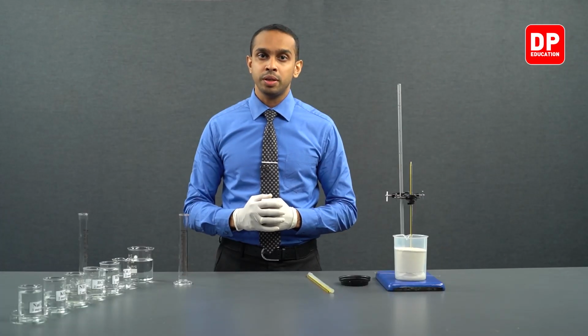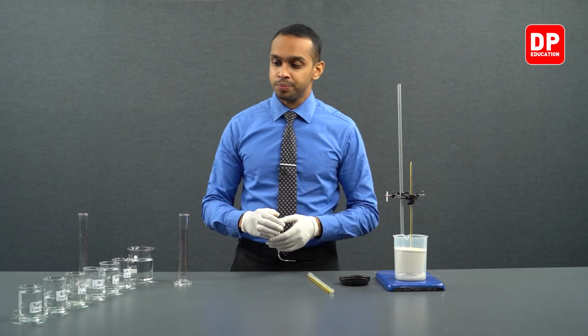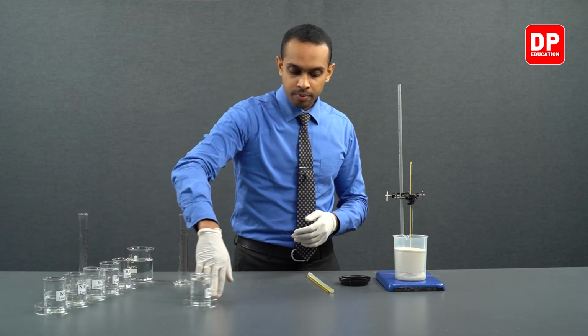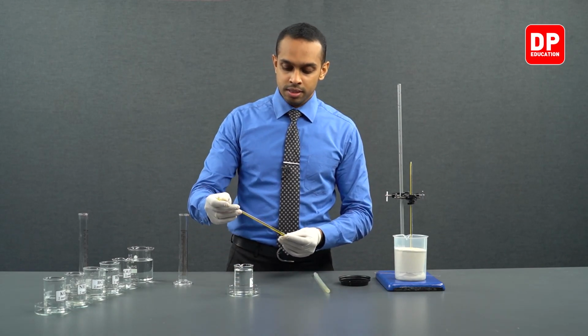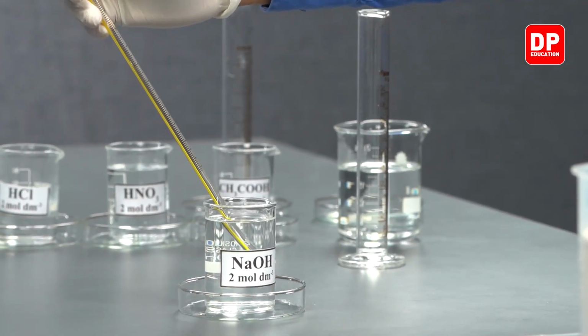Let's move on to measuring the temperature reading of our sodium hydroxide solution. We have our sodium hydroxide solution here. And now we'll use a different thermometer and measure the temperature of the sodium hydroxide solution.